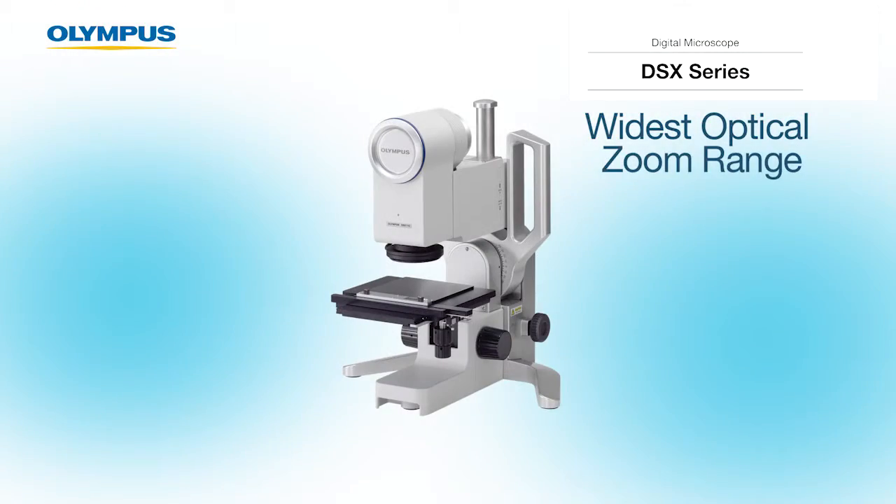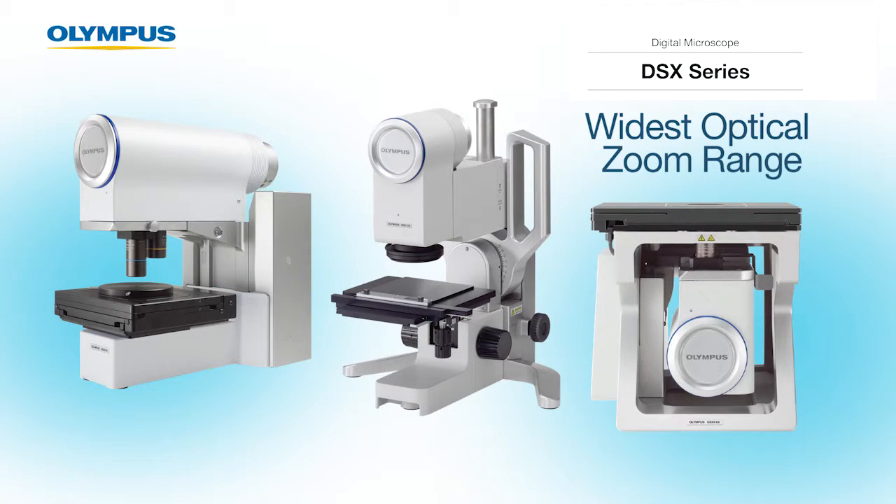Hello, my name is Christy Cobble from the Industrial Microscope Division of Olympus. In this video, I will discuss the wider optical zoom range available on the DSX series digital microscopes. Olympus DSX microscopes provide a wider optical zoom range than any other digital microscope on the market.